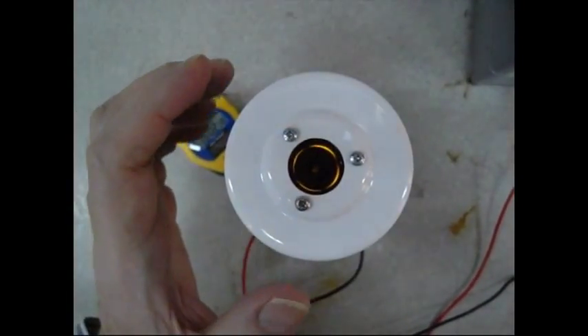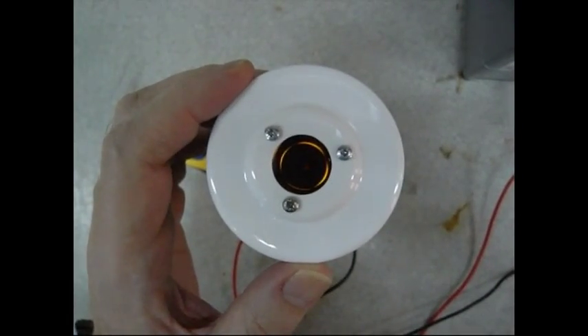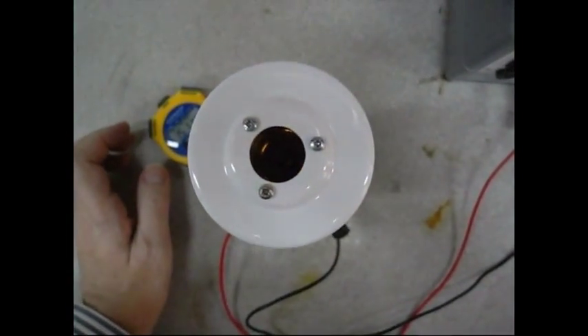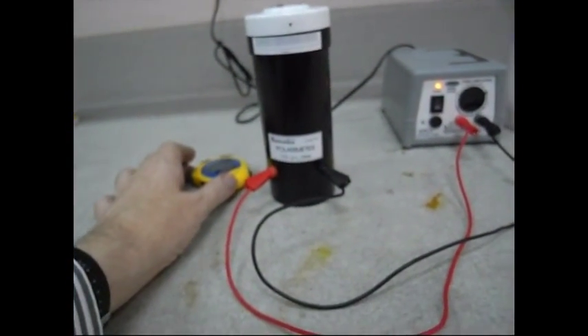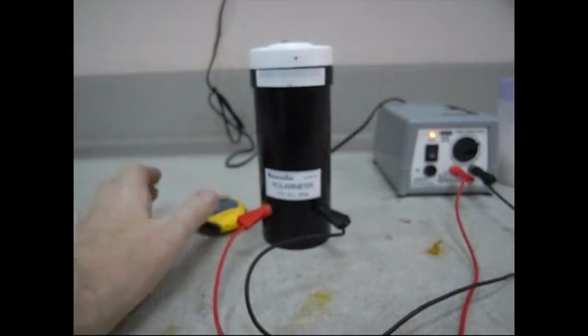Here we are at fifteen minutes. We see light through the centre of the polarimeter. Let's extinguish that again and take another reading — it's now at about 54 degrees at 15 minutes.